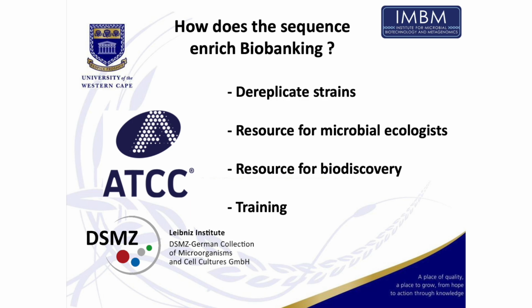Okay, so how does sequencing enrich a biobank? I've just listed 4 things here that I think are most important. Just to mention the 2 biggest culture collections in the world, the American Type Culture Collection and DSMZ, both have now started sequencing all the bacteria in their collection, and those genomes are also available to anybody else. So from my perspective, the way that sequencing helps the biobank is, one, to de-replicate strains. You don't necessarily want to carry 1 million copies of the same bacterium in your biobank.